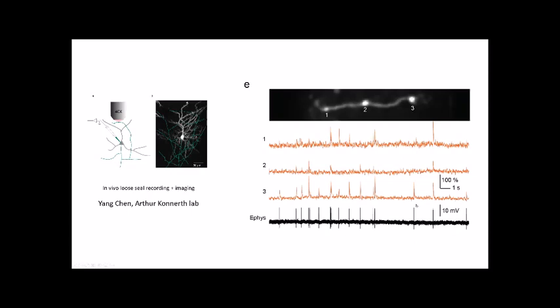And so here's a single action potential, and here is the fluorescence trace at a single bouton corresponding to a single action potential. One thing that's very conspicuous is that the adjacent bouton shows no fluorescence trace, and these are what failures are. This is a well-known phenomenon where even though you get calcium influx with an action potential, because vesicle fusion is random, and on average roughly one vesicle fuses per action potential, you can get these failures where there's basically no release. So that's very cool. We can see successes and failures of individual action potentials with very high SNR.